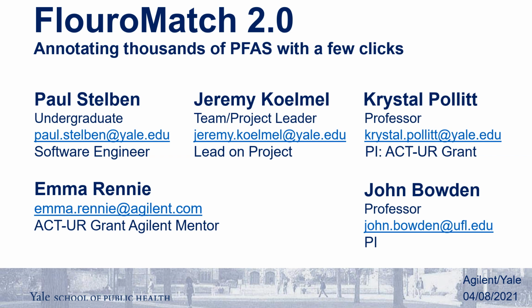Now today I'm going to be talking about FluoroMatch 2.0. This is the newest version of our PFAS software and the only open source PFAS software for non-targeted mass spectrometry.